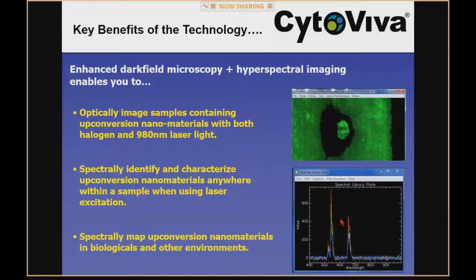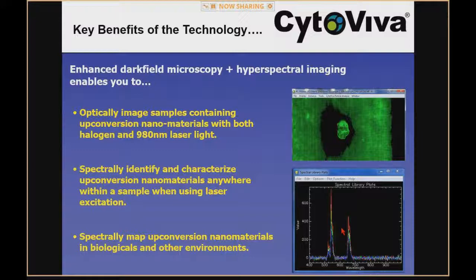The key benefits of this technology for upconversion include the ability to optically image samples using both halogen full-spectrum illumination and 980 nm laser illumination. Capturing a hyperspectral image first with halogen and then with 980 nm excitation lets you link the two displays together — so in halogen mode you see the full sample context, and in the upconversion image you see the upconverting nanoparticles and their spectra simultaneously, enabling spectral mapping of upconversion materials anywhere they exist.